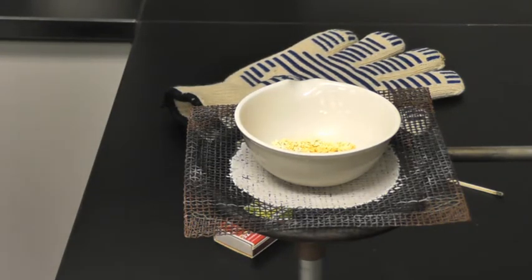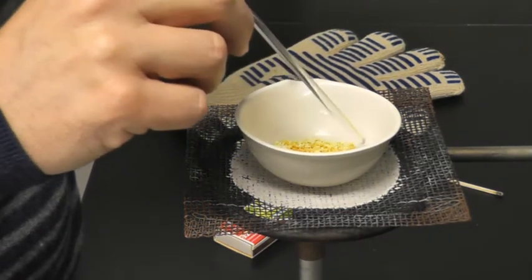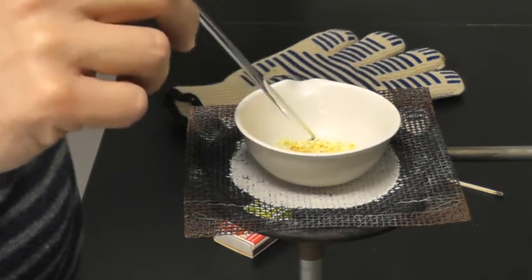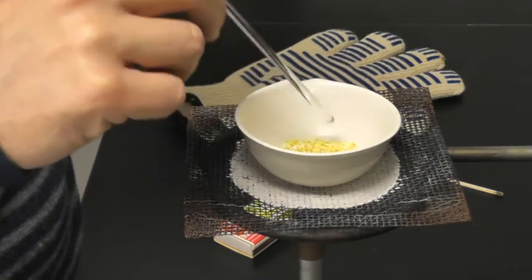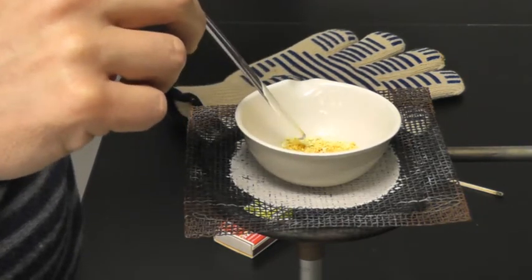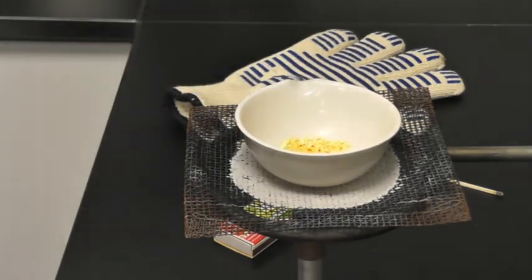So then you are going to end up heating it 3 times and weighing it 3 times. But weighing and heating twice ensures to you that you got all the water out. I'm just going to break up some of these bigger chunks again. And we'll let this go about 5 minutes, and we'll do our first weighing, and then we'll come back, heat it, and weigh it a second time. Alright, so we'll pause it again.